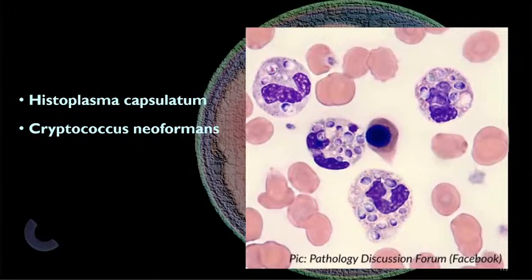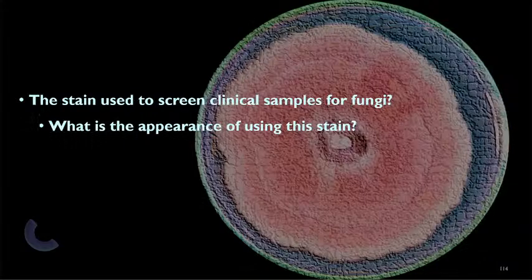Okay, gets nyo kung anong pinakaiba? May parang bluish tinge. Ayan, no? Nakita nyo yung bluish tinge. Pag WBC anomaly siya, like toxic vacuolation. Ito, may toxic vacuolation siya. Look at the toxic vacuolation. Walang bluish tinge. Hindi nai-stain yung nasa loob, kasi wala namang stain sa kanya kasi vacuolation nga lang siya. Pero ito kasi, merong carbohydrate elements. Ngayon, tinatawag natin chitin. Okay? Clear? Madali lang, no? Tapos pag tinanong na sa exam ninyo, hala, sir, ano yan? Anong kaguluhan yan? Pero hopefully, maalala nyo.